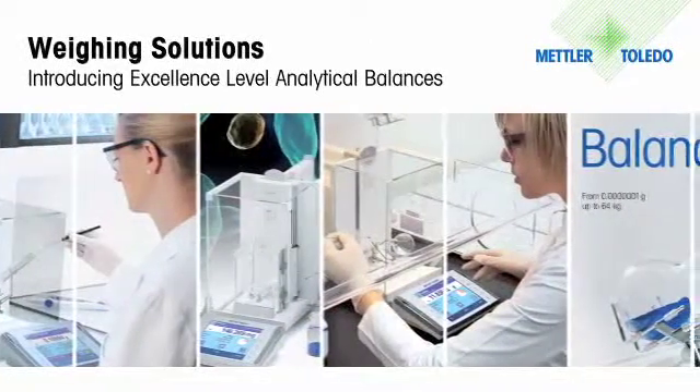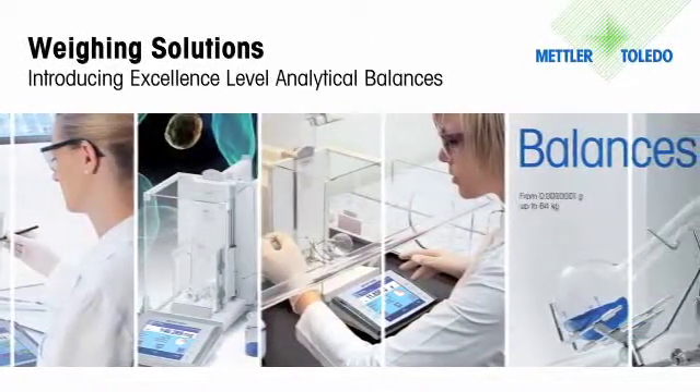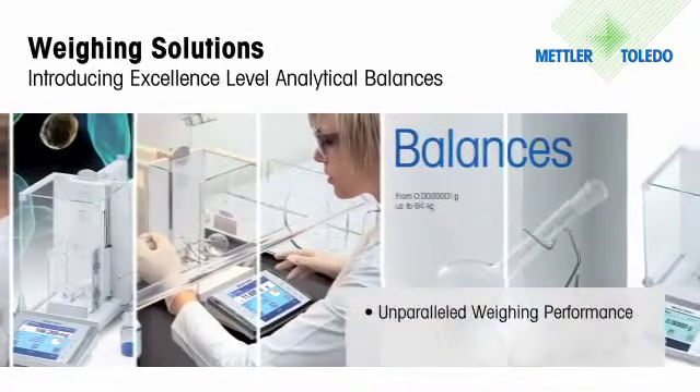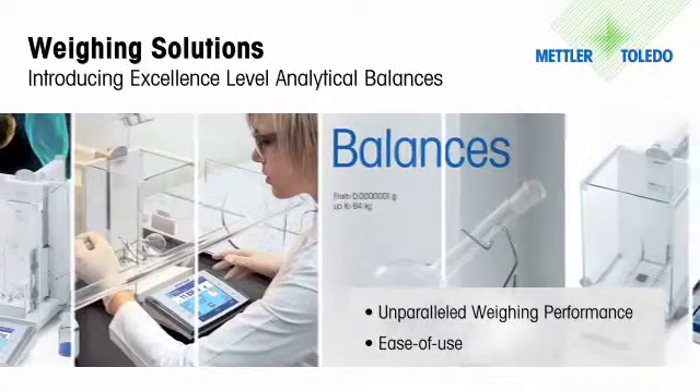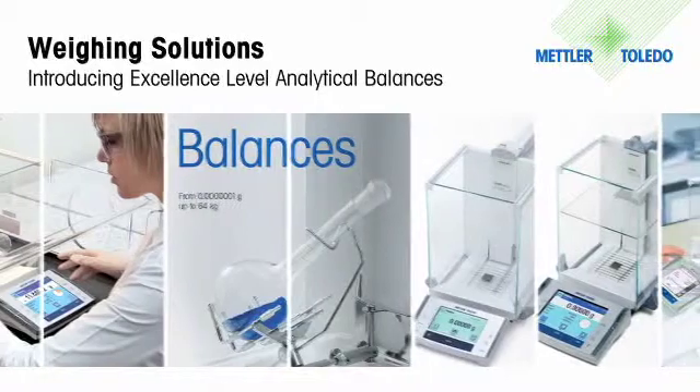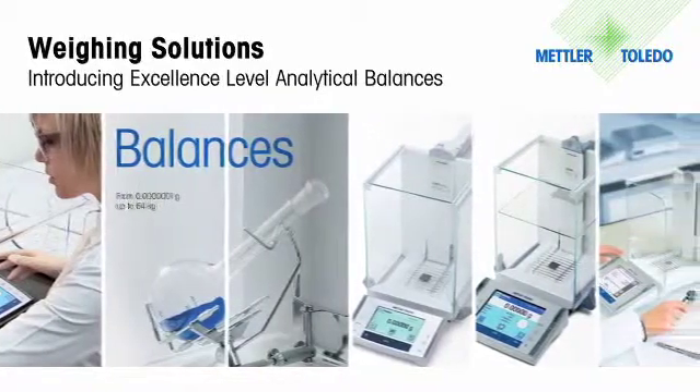Mettler Toledo Excellence Level Analytical Balances provide the perfect combination of leading-edge weighing technologies and incredible ergonomic design. With unparalleled weighing performance, ease of use with touchscreen technology, and the utmost in data security, Excellence Balances can increase productivity and quality in the laboratory.